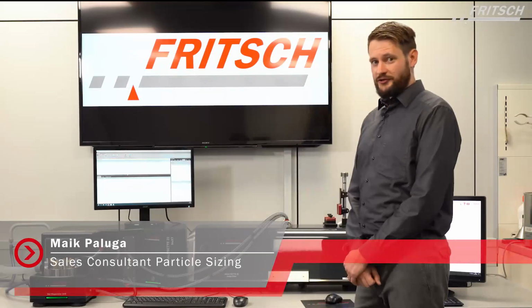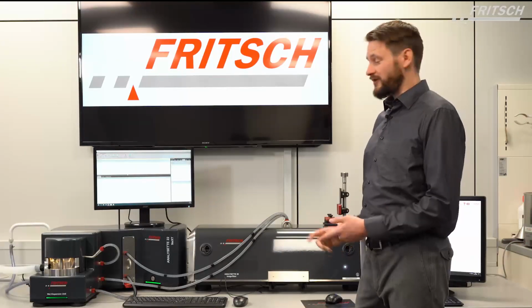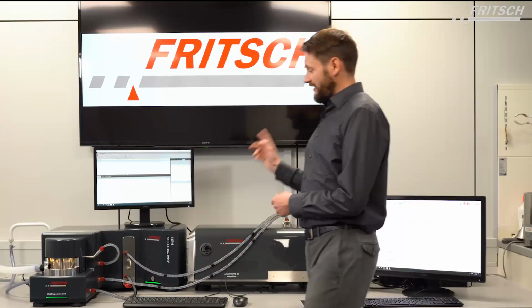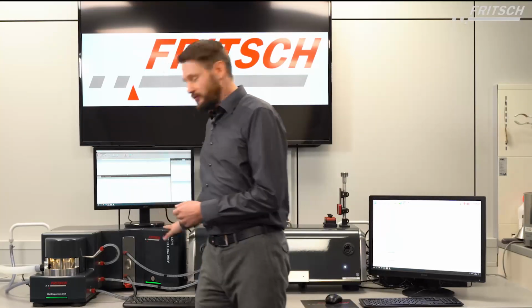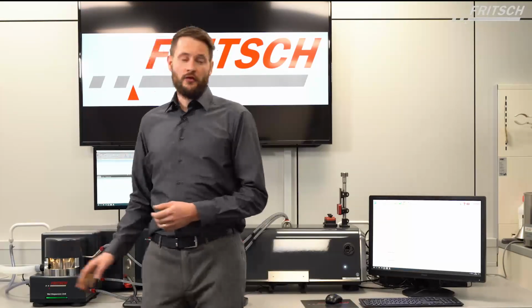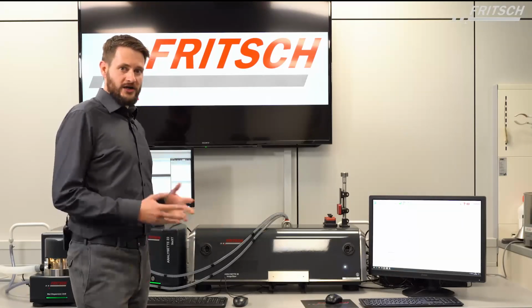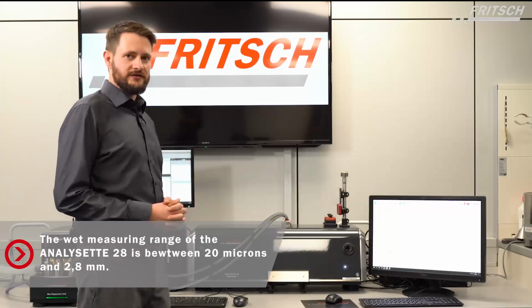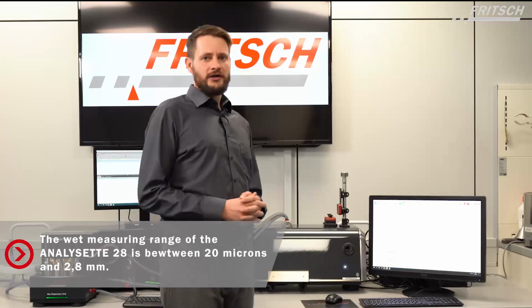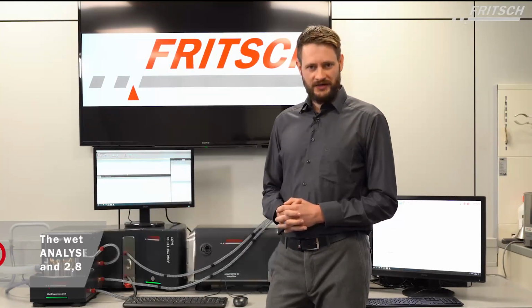Today I would like to show you how you can combine both of the optical instruments in our portfolio into one system. On the left side you see our brand new laser particle sizer, the ANALYSETTE 22 Next, including the wet dispersion unit. On the right side you see the ANALYSETTE 28, our image analyzer, which usually is operated in dry mode, measuring shape and size of free-flowing powders up to 20 millimeters.